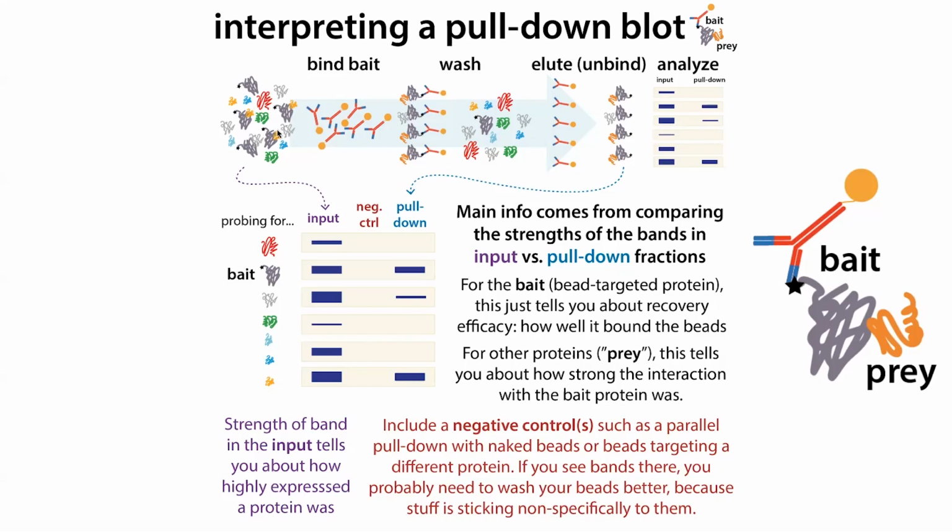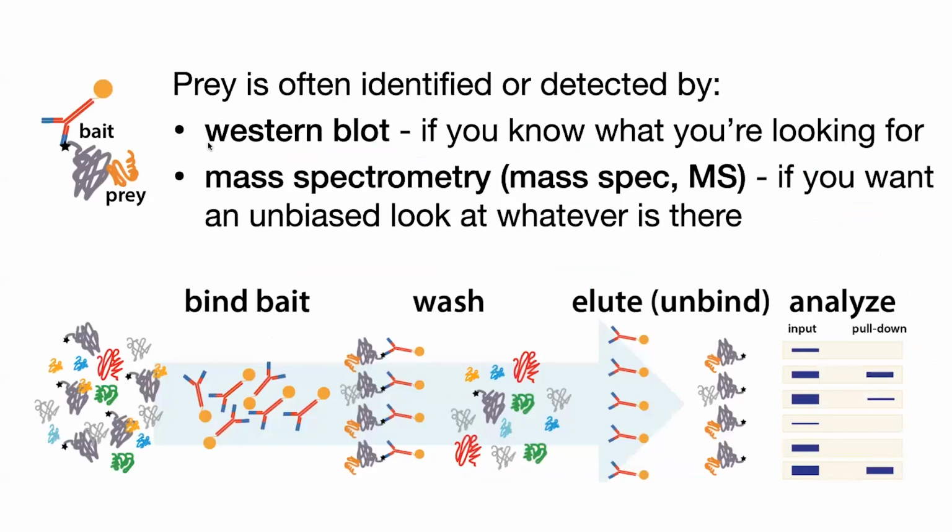This can be an important experiment if you're trying to see whether a certain part of the protein is important for binding. So you're often using a cell lysate, but you can also use purified proteins. There are a bunch of different variations of pull-down experiments, co-IPs, and things like this, and it all depends on what type of questions you're trying to answer.